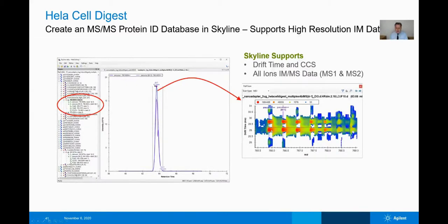We have such high selectivity that we can now use just the selectivity of the ion mobility, the mass accuracy, and of course the retention time to give us the uniqueness we want. And because there's no switching back and forth between MS and MSMS, we're able to capture the full ion current of the precursors at high resolution, high selectivity, and do our quantitation in a way that gives us higher sensitivity than we have been able to achieve previously.